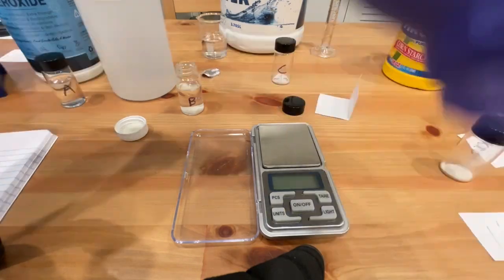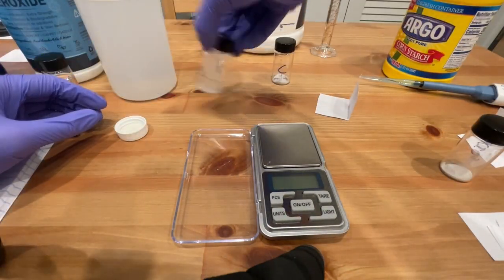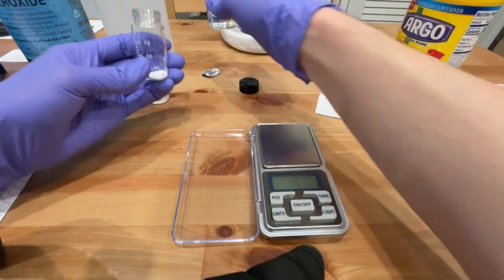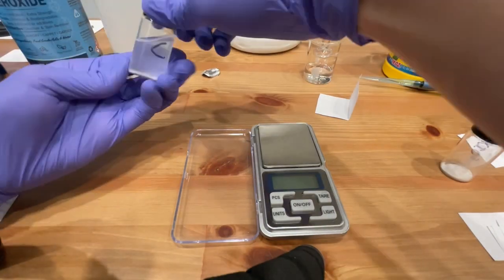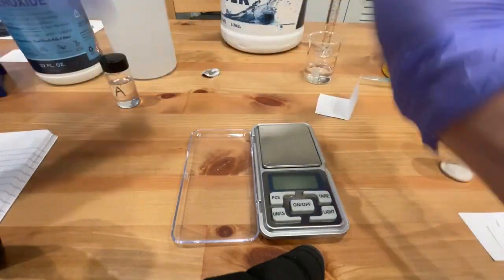Then 1.2 milliliters of 1 molar sulfuric acid was added to vial B. Vial B was then shaken to mix and dissolve the potassium iodate. Finally, deionized water was added to vial C up to the 15 milliliter mark, about 13.5 milliliters, and the vial was shaken to mix and dissolve things as best as possible.